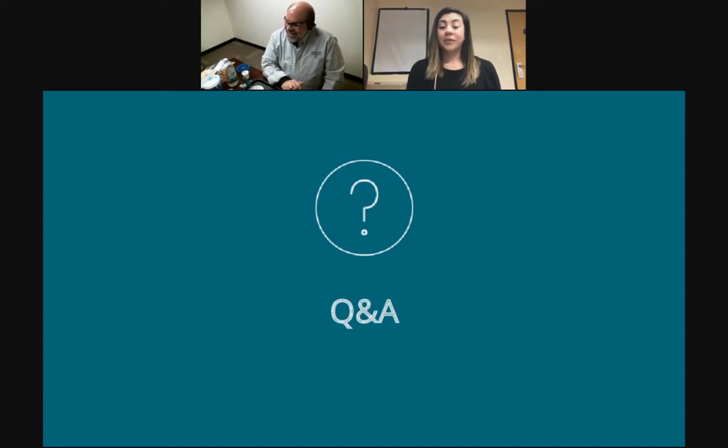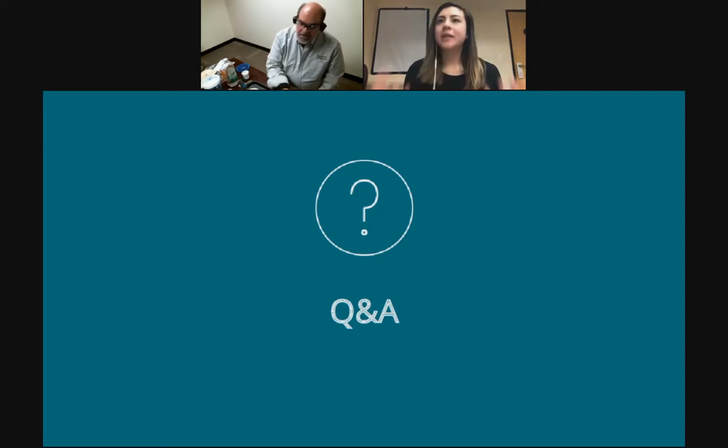All right. Well, we have more questions. So we have a particular individual that's asking about using probes for measuring gases, or specifically, he said aerosol particles. And I don't know how much we can get into example activities. That might be something we have to go offline for, but anything around that. We don't have anything quite at the level that you're talking about. We do have a gas pressure sensor that will measure the total pressure of gases. We do have an oxygen gas sensor.